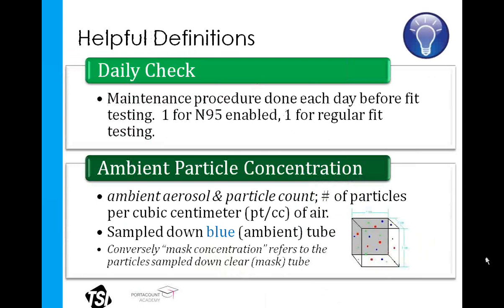Now, here's some terms you're going to hear many times during this presentation, so let's define these now. The daily checks should be done each day of fit testing in order to make sure that the PortaCount Pro unit is functioning properly and that the environment you are in is appropriate for performing fit tests. If you know you'll be fit testing both full face and half face masks and N95 filtering face pieces, then you should run two daily checks, one with the N95 option enabled and one without. We're going to see that option in just a little bit.